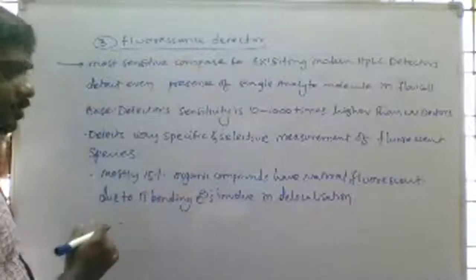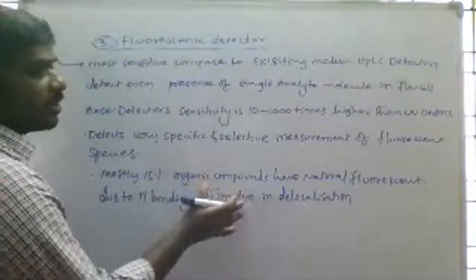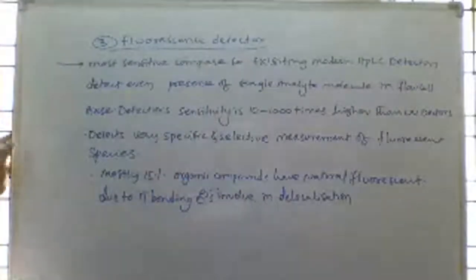Because of delocalization, they exhibit fluorescent nature, and the fluorescence detector detects them.